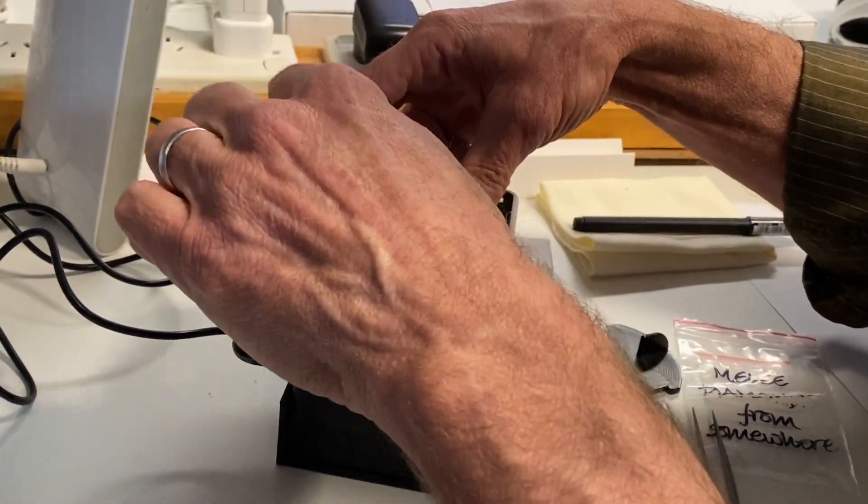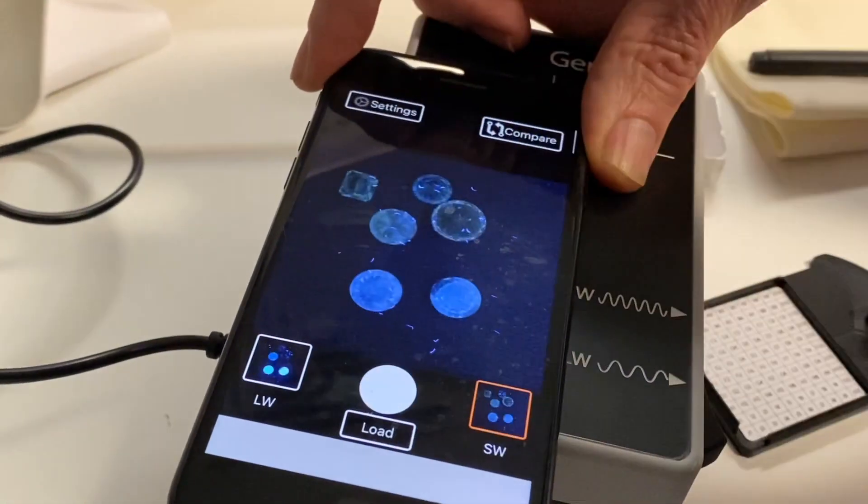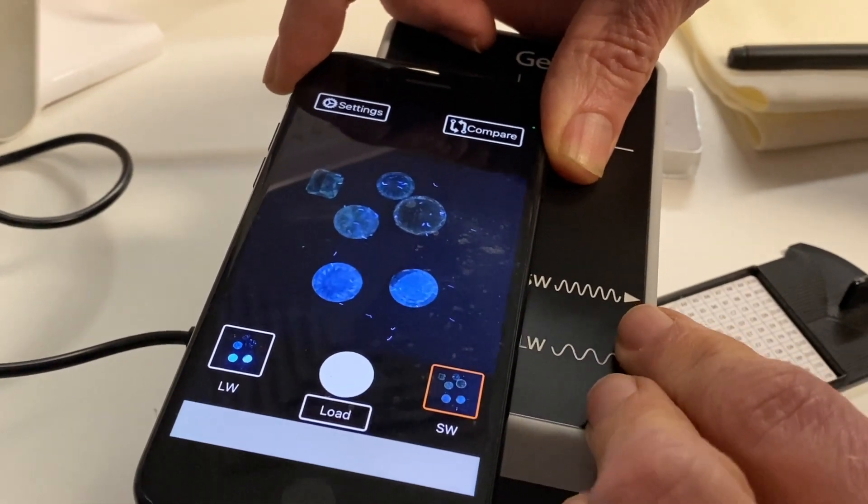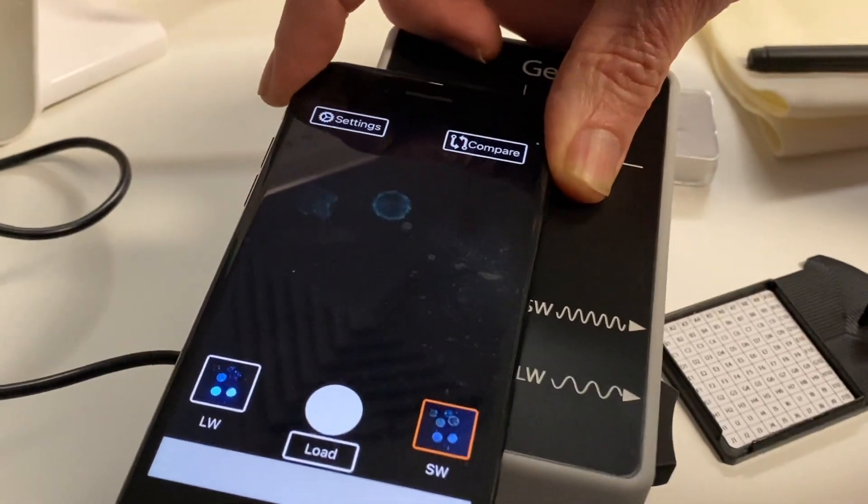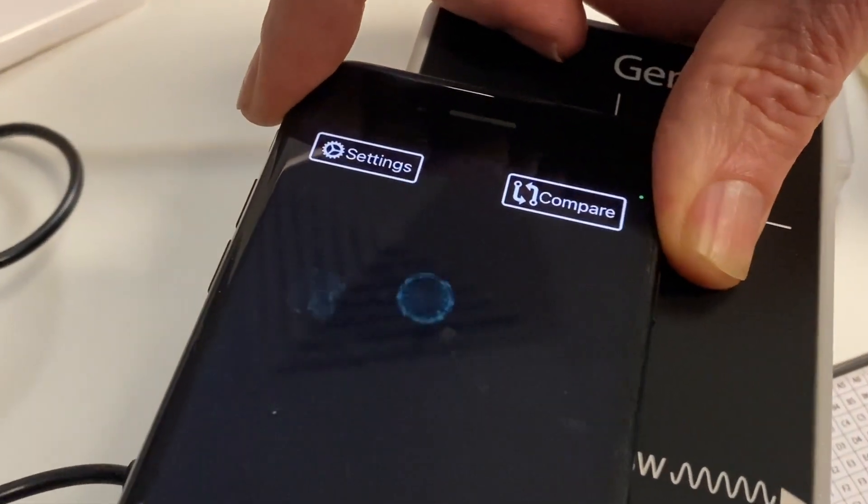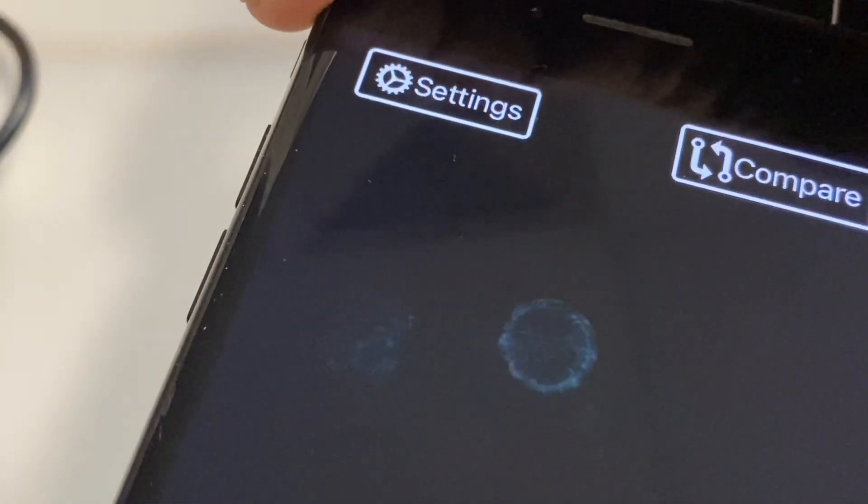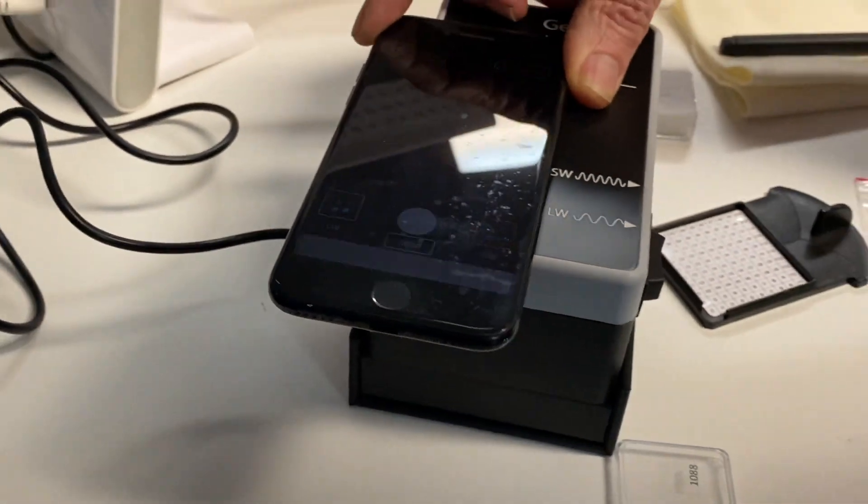Well, you won't get as much, but I want to show you something else as well, which helps us confirm the nature of the synthetic diamond. If I go back to what we were looking at, you might... Oh, let's go back one further. This is the short wavelength fluorescence, and you'll notice when I switch it off, two of them. Oh my gosh, you can see it glowing. That's what is known as phosphorescence. And you didn't even need to turn the lights off in here. Well, that's the beauty of this system.